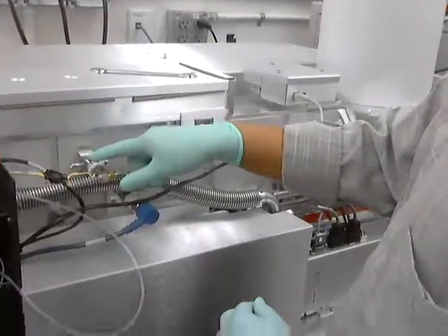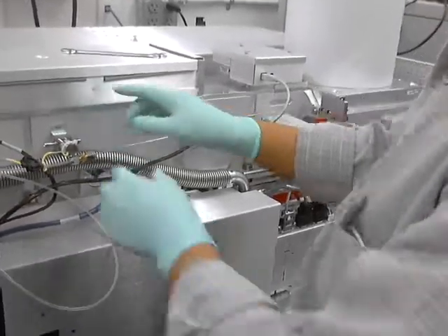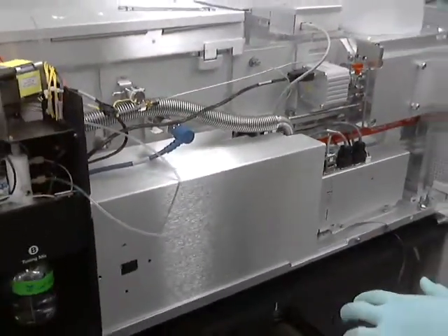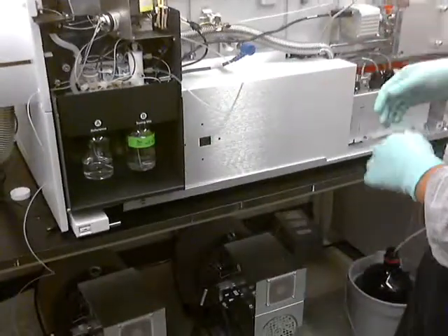The vent valve shuts off. So now we've got nitrogen — that's really good to pump it down. When you pump it down, it will pump down a lot faster.